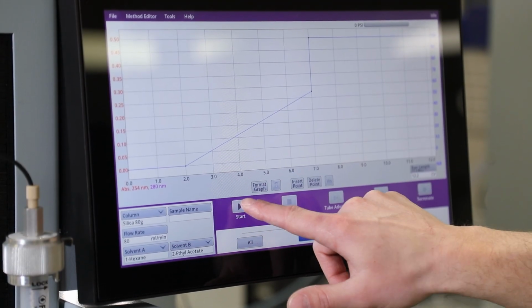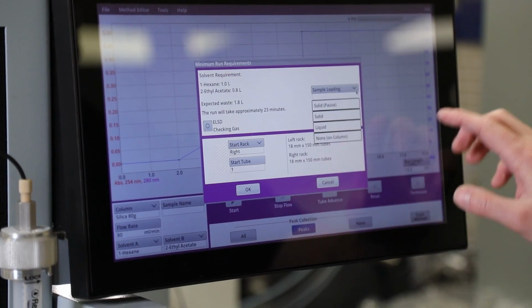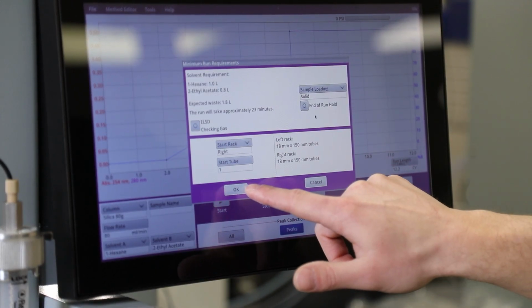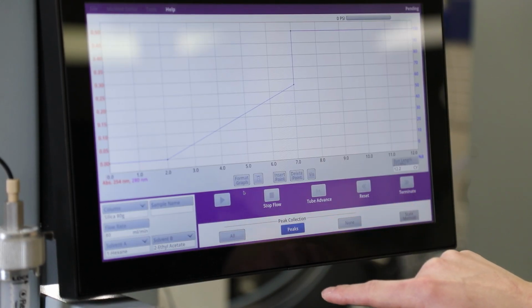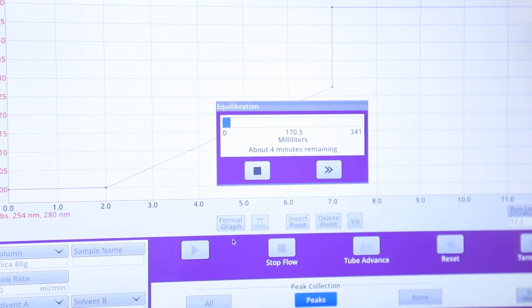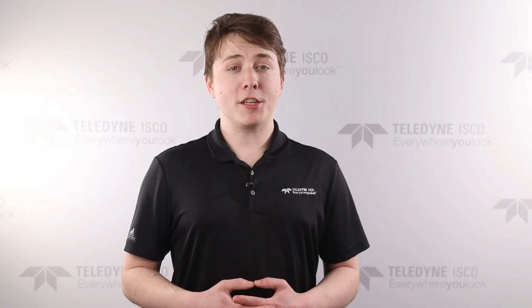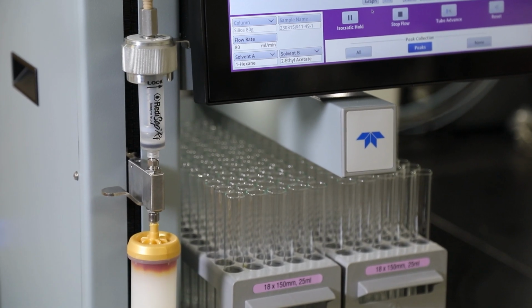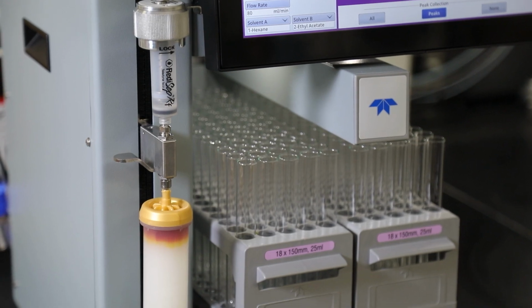Press the Start button on the main screen. Press the Sample Loading menu button and select Solid. Press OK. The NextGen will require a few minutes to equilibrate before it can begin injecting the sample into the column. Once the equilibration is complete, the sample is injected into the column using our mobile phase, the solvent mixture of hexane and ethyl acetate.